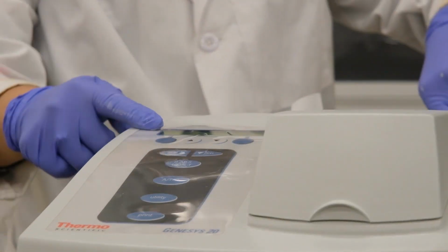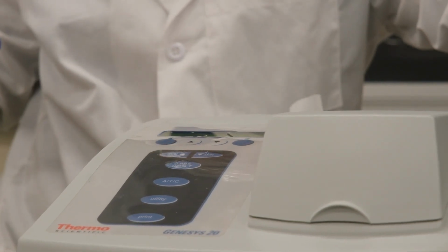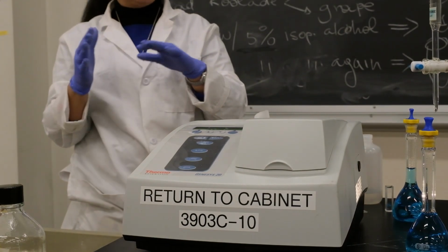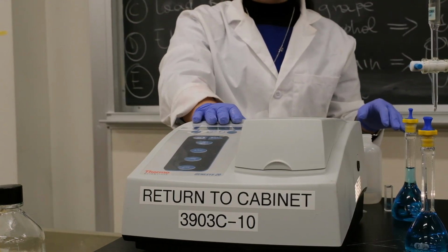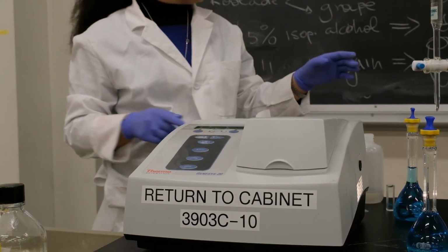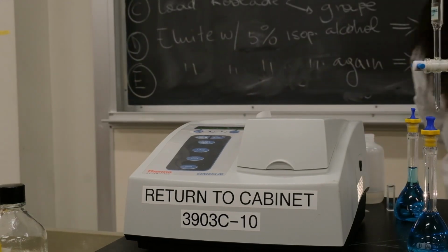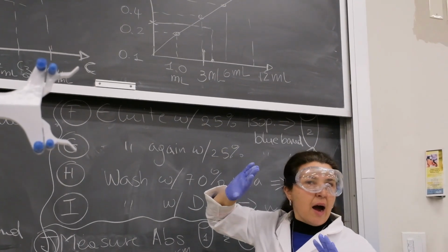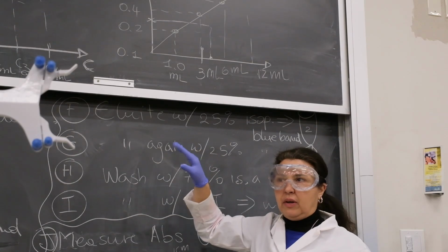So we start to collect the first one, and then we keep going on and on until we get our maximum. When we reach our maximum, we go 5 before, 5 below, and we obtain our absorbance. Once we have done that, we prepare our other solutions based on that value, and we obtain these 4 points. The numbers that I gave you here are not the real numbers, they are numbers that you have to determine, okay?